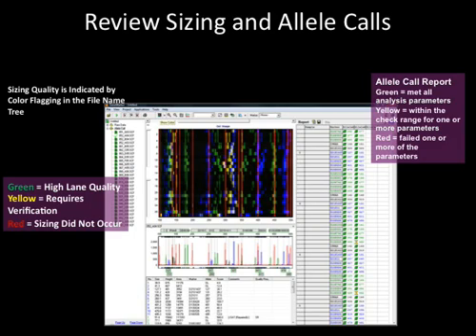The synthetic gel image and electropherogram are at the center of the main analysis screen. All channels are shown in this view. The table displayed below the electropherogram contains information on each peak and automatically registers a comment and quality reason for any raw data analysis actions.